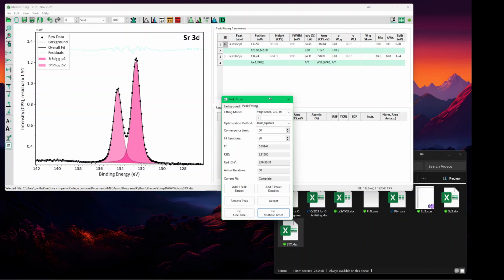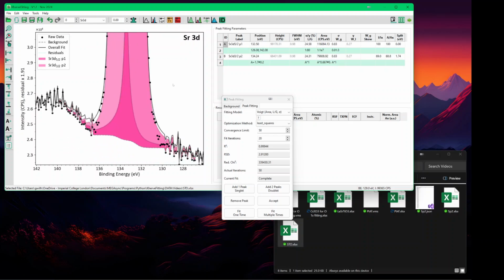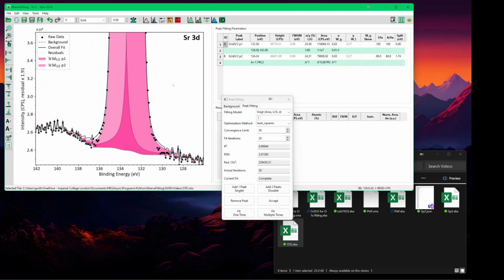And we can, so let me just change. So we got around 25%. And we got a width of 0.98, which is similar to all the other widths. And let's see how good it fitted. Sorry. So this is also a bit overshooting, but this is actually the true one. So that's the one I would trust more.